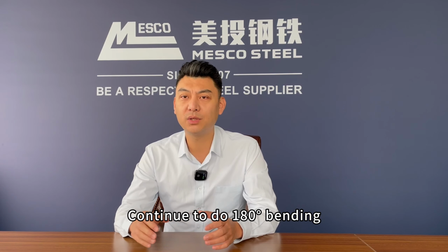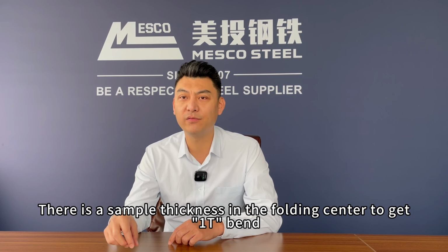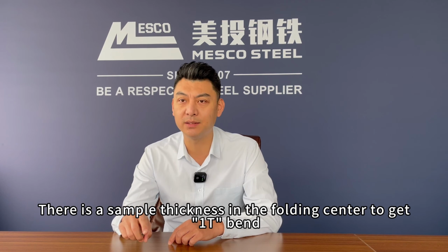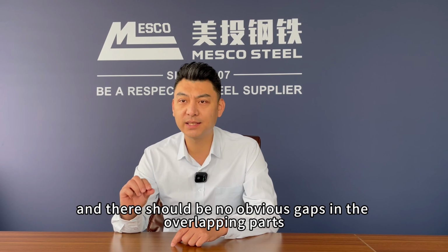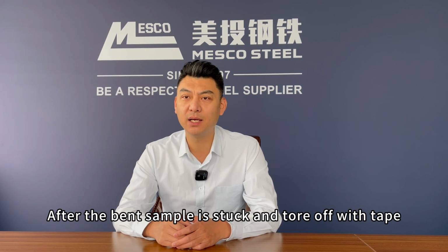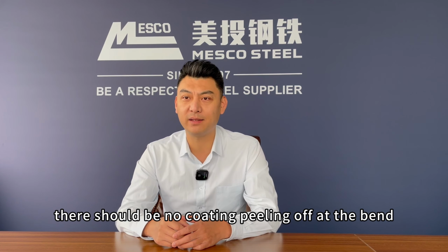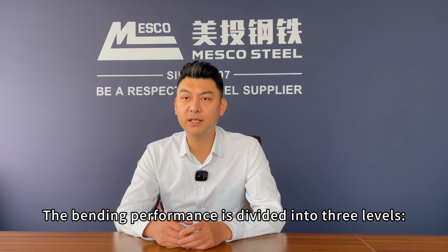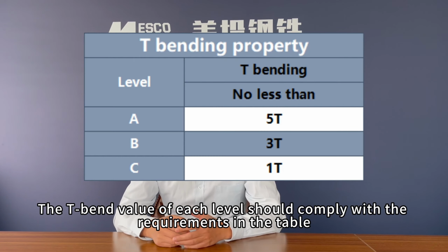Continue to do 180 degrees bending. With a sample thickness in the folding center, you get 1 T-bend. Bending can be obtained in turn, and there should be no obvious gaps in the overlapping parts. After the bent sample is stuck and torn off with a tape, there should be no coating peeling off at the bend. The bending performance is divided into 3 levels, A, B, and C. The T-bend value of each level should comply with the requirements in the table.